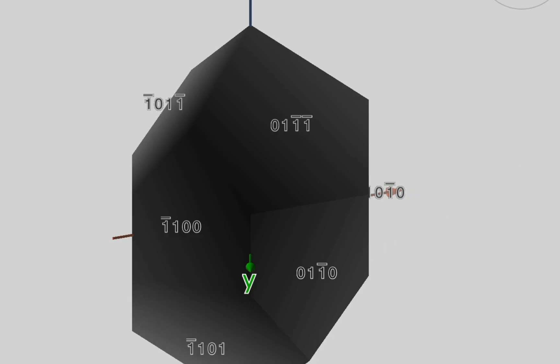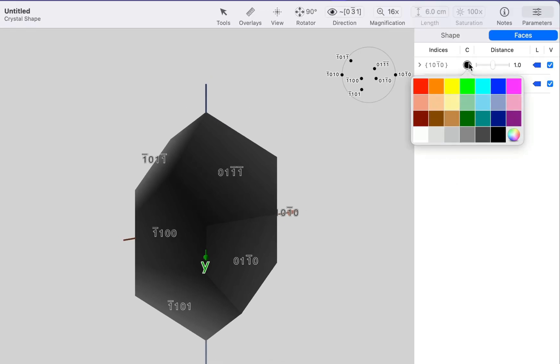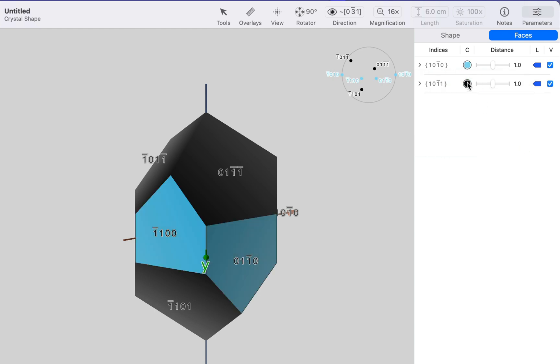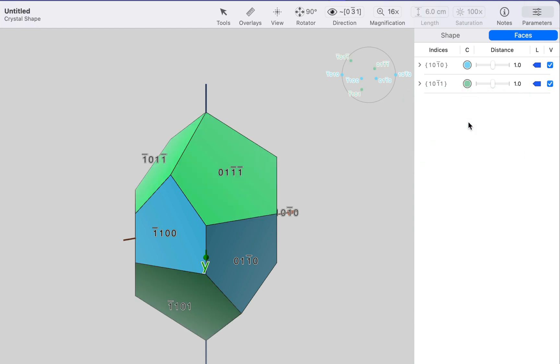Now we also want 101. And now we've got two sets of faces and we can set some colors for them. Let's go for something relatively civilized. Cyan. And let's have a green. So here's a stubby crystal. We haven't edited the positions of the faces yet, but this is the start.